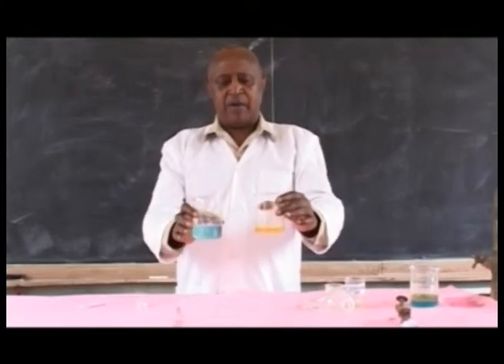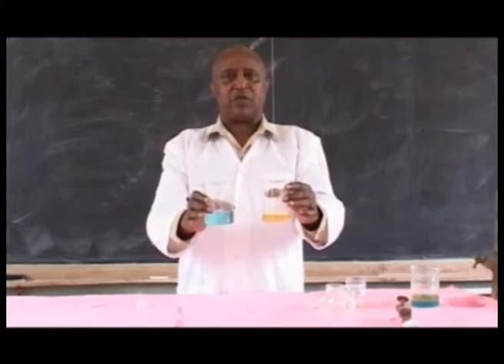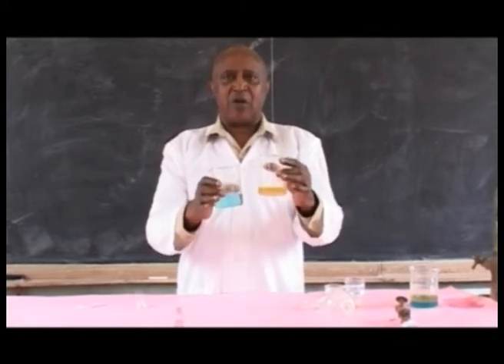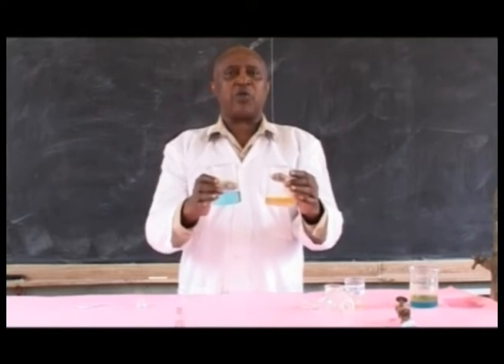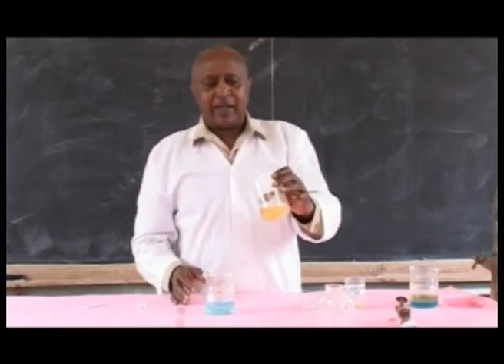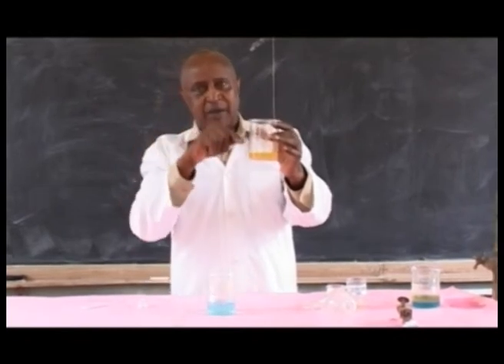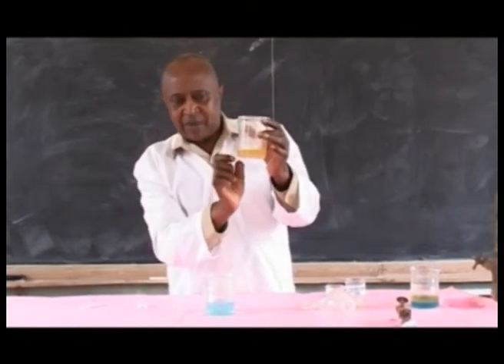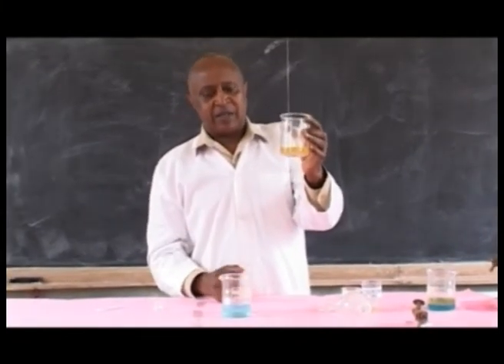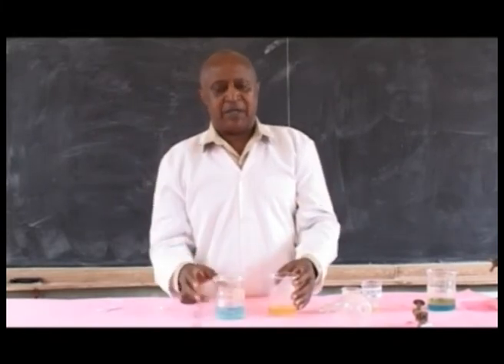Now you will have two of the components of the mixture separated into different containers, and the process of separation can be repeated so as to purify the components. What you will see is that this is not completely separated, because you can repeat the procedure so that a bit of the layers can continue to be separated. It's not a one-shot process. It should be repeated and repeated for purity.